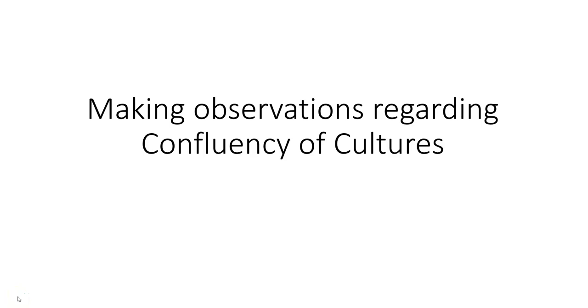In this particular video, we're just going to go through some example images from cell cultures and try to figure out the confluency of those cultures. So this will just give you some practice making those observations.